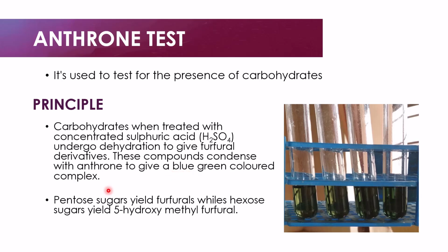What you also have to note is that pentose sugars yield furfural, while hexose sugars yield 5-hydroxymethylfurfural. So these are the positive results for the anthrone test.